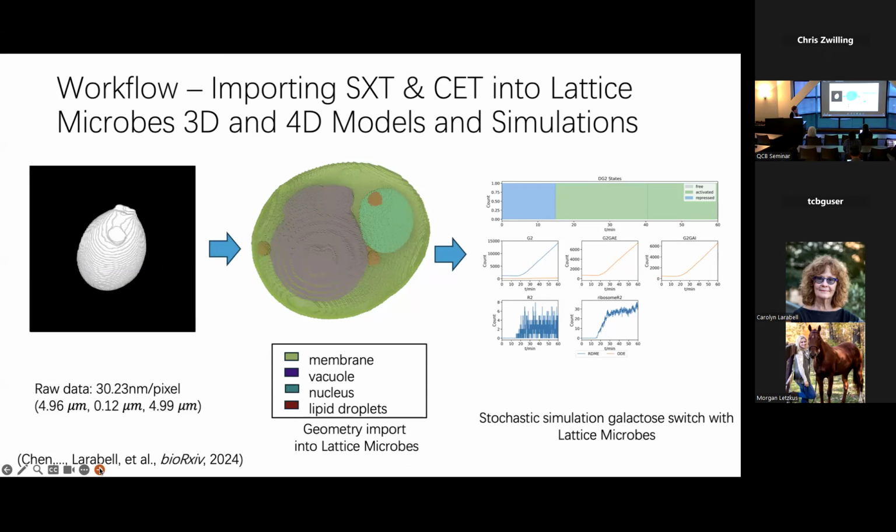The thing that I noticed that it's difficult for all of the methods to give you is information on the endoplasmic reticulum, and that is something that Julia Muhammad is really working on with her tomograms at the moment. Also, you notice in some of the yeast pictures, the mitochondria cannot be automated, so you don't always get that, but you will get the droplets and the nucleus and the vacuole. So this is sort of the state of the art.